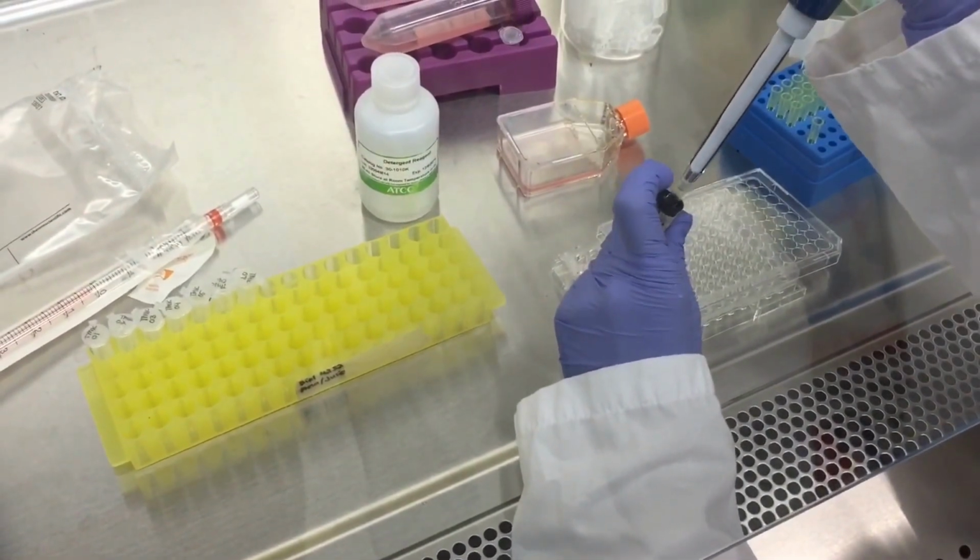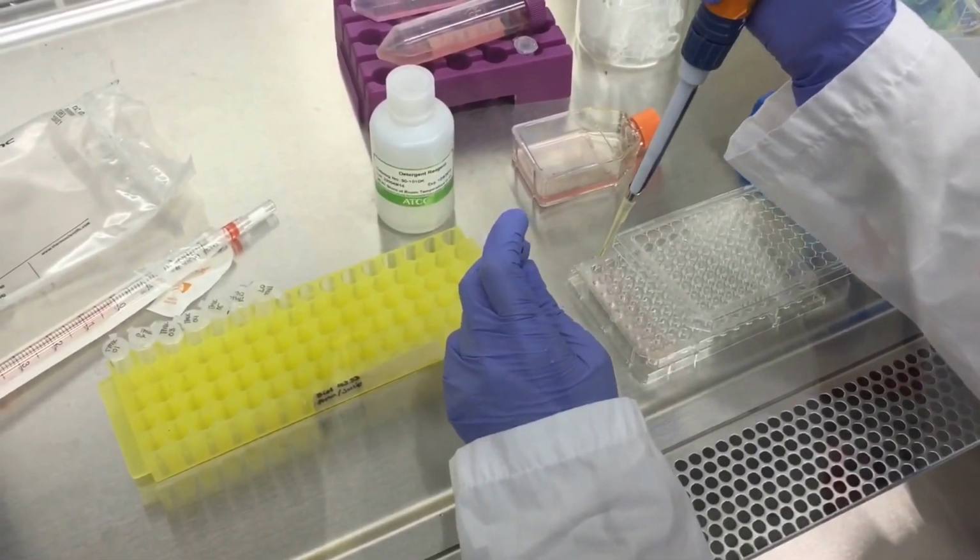And make sure you warm up your MTT in the water bath for around 20 minutes.